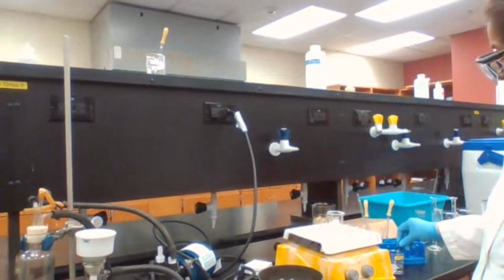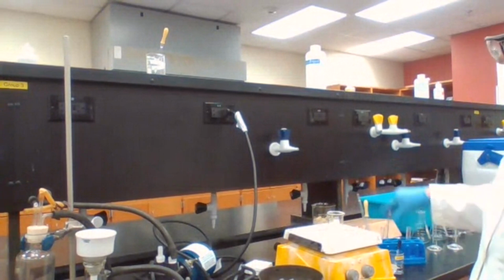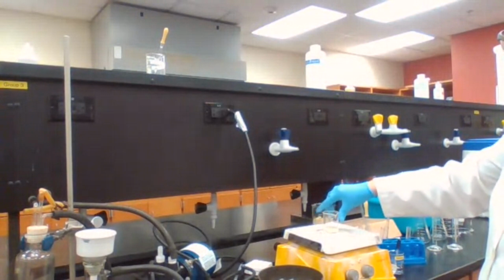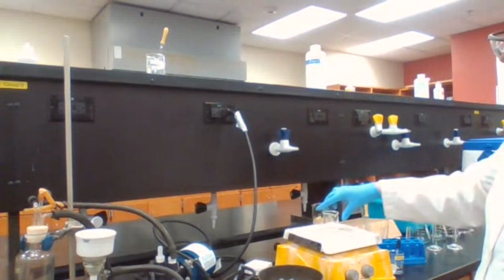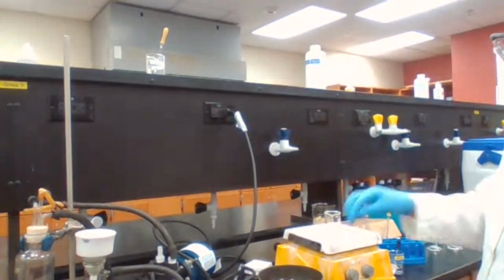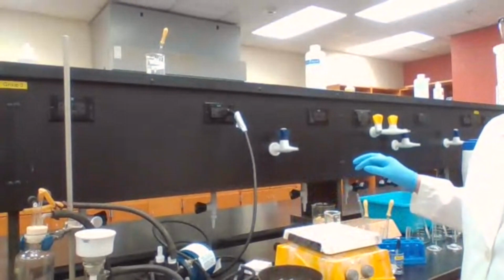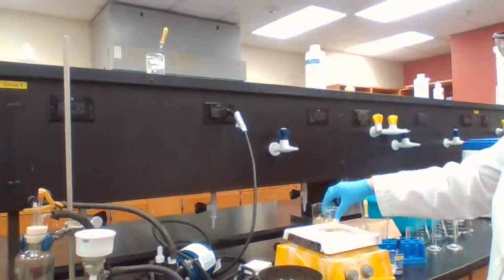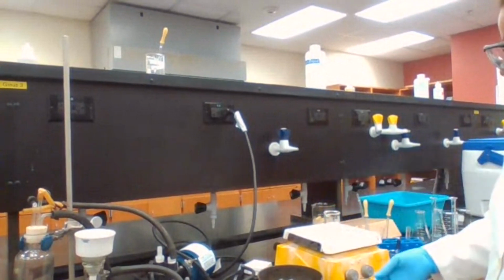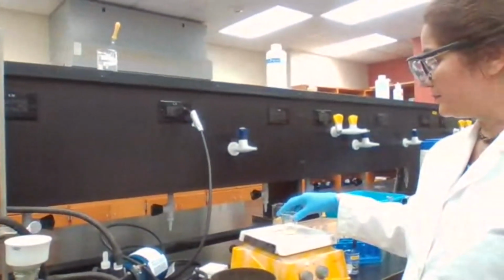Then cool it down to room temperature, then place in ice. That's the recrystallization. We heat the solid sample with the minimum amount of the recrystallization solvent, dissolve it at high temperature, cool it down to room temperature, then place in ice bath for complete recrystallization to recover the crystals back at lower temperature.